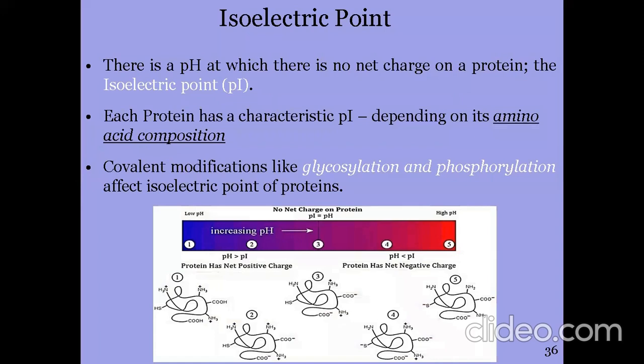ये बहुत ही stable molecule है, if we compare that with the DNA and RNA. इसके chances इसमें इस तरह होते हैं कि electrophoresis के दौरान temperature high हो जाता है, तो फिर उसके साथ कूलेंट्स ऐड किए जाते हैं. वो टेम्परेचर शायद प्रोटीन्स को डिग्रेड करे, इसकी कन्फर्मेशन को चेंज करे. लेकिन जहां तक प्रोटीन्स की बात है, प्रोटीन is more stable and reliable, काफी रिलायबल है.